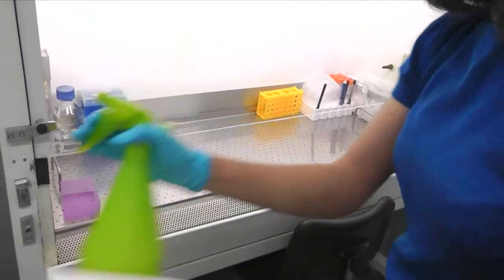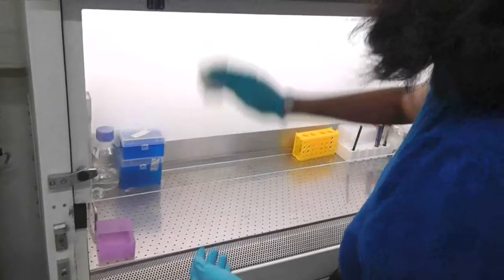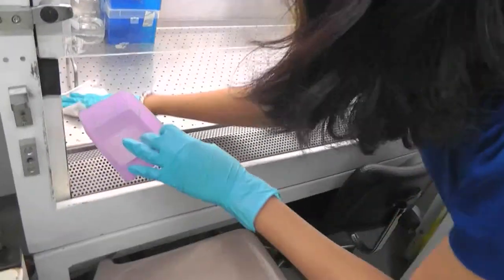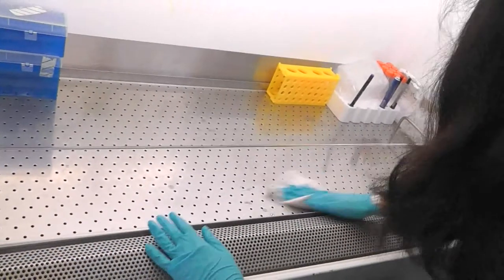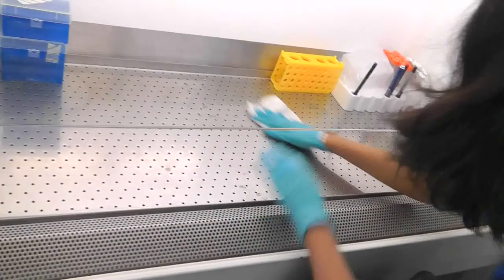Before working in a laminar hood, we need to ensure the glass of the hood is sterile. As you can see, the glass is wiped down using 70% ethanol. The surfaces inside the hood are also wiped down with 70% ethanol to ensure none of the equipment or the cell culture comes into contact with contaminants.